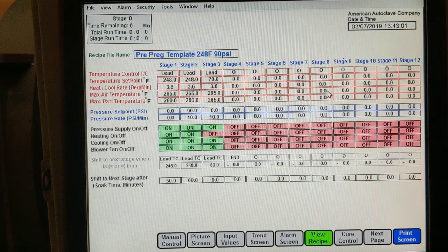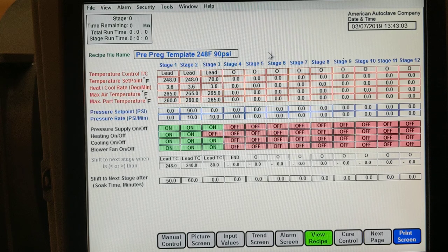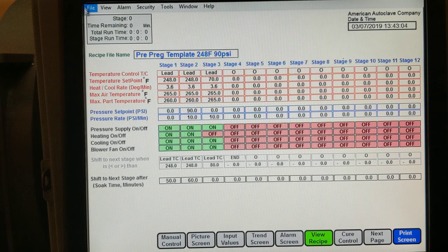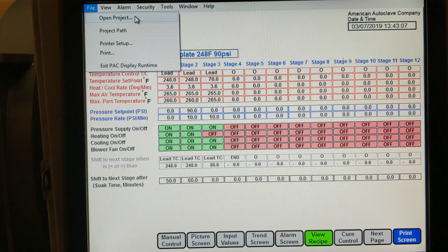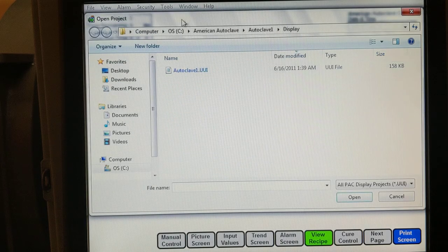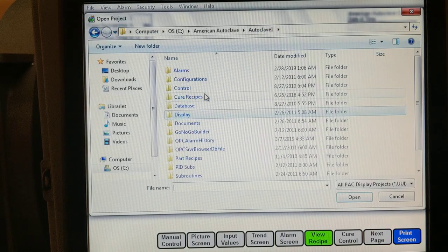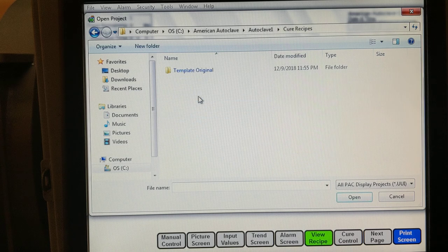Now let me show you the wrong way of opening the recipe. File, open project. If you try to open the recipe by doing open project, it will cause problems.